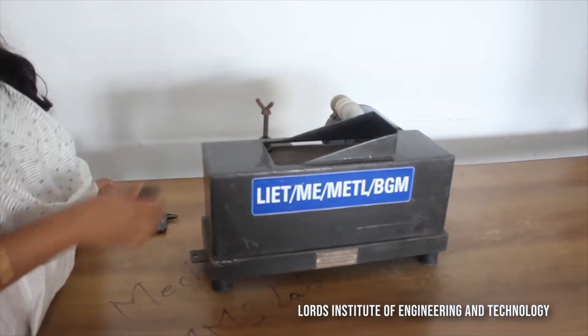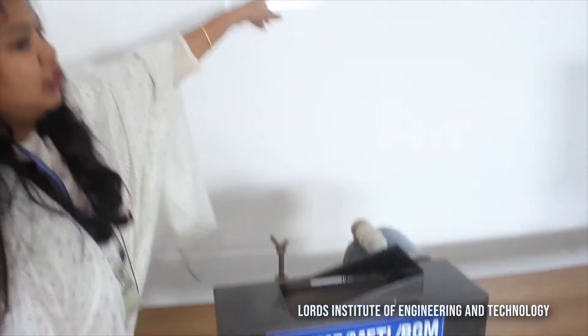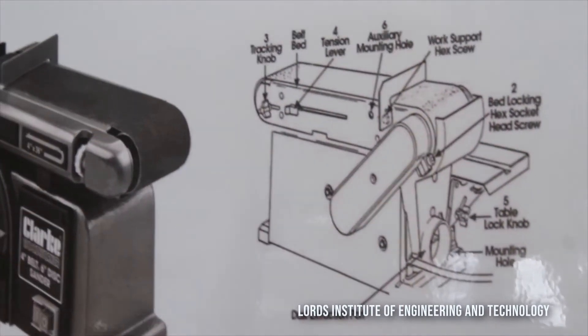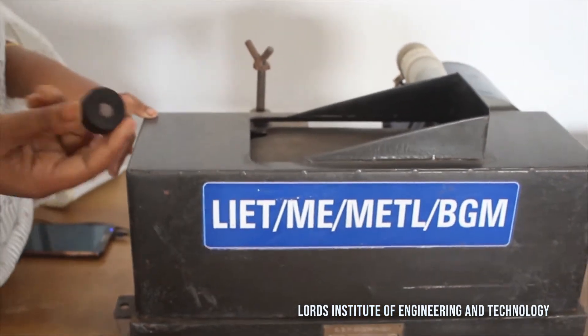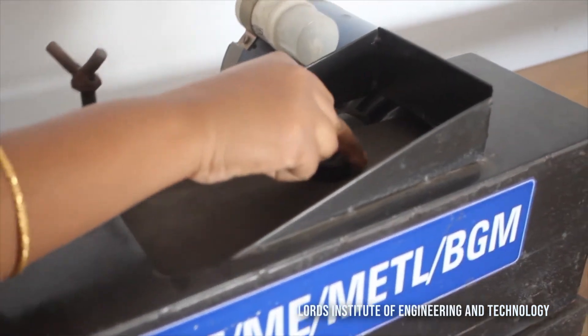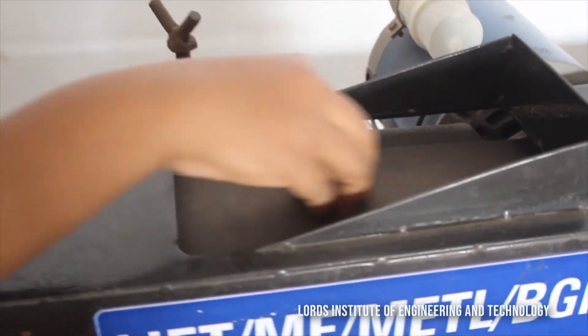This is your belt grinder, and you can see its different components on the chart. Here we are going to carry out grinding of the different specimens. After solidification, we obtained the specimen as described, and now we are going to proceed with grinding.